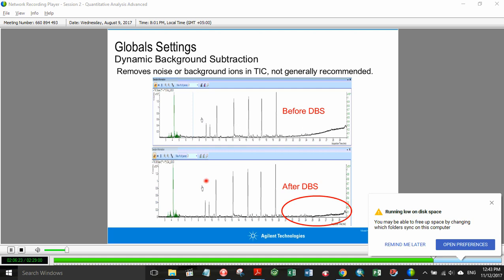All right, what value is this? Well, essentially all it is, is the TIC in the sample information chromatogram there. What the algorithm is doing here is looking for ions that have no specific peak shape associated with them when we do the extracted ion chromatogram. Background noise, for example, column bleed from a GC column, the 207, 281 ions that we typically see as background from our GC columns, those would be subtracted out, therefore lowering that background at these higher oven temperatures as we're doing an oven gradient.